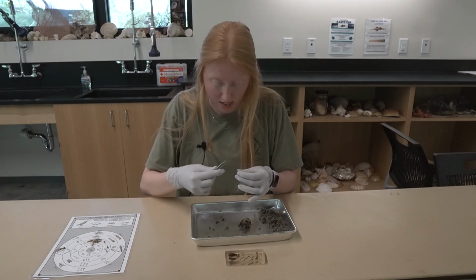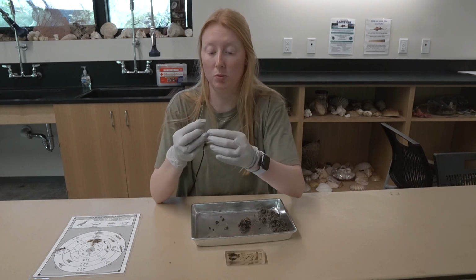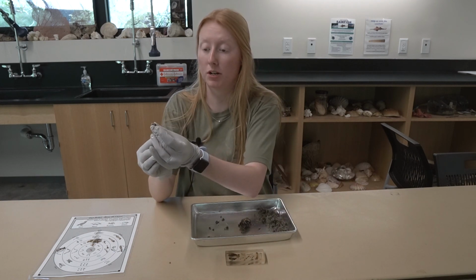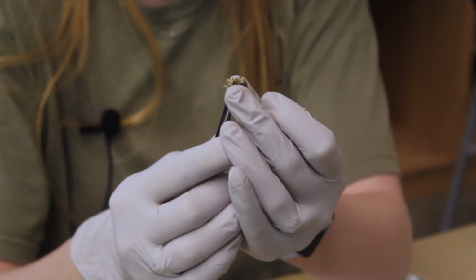So these right here are going to be two vertebrae. These were attached, but since I just pulled fur off of them, they detached, since that was the only thing left holding them together. But those are going to be two vertebrae, probably of that really, really large mouse that this owl ate.